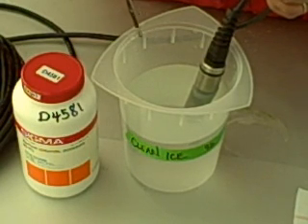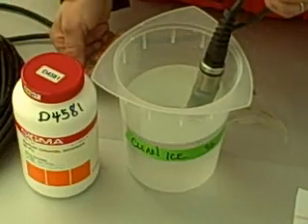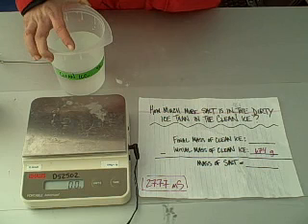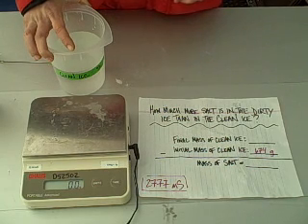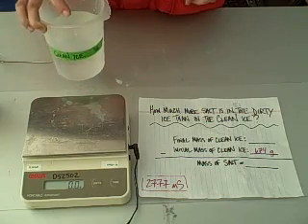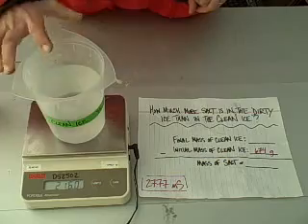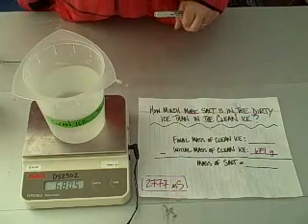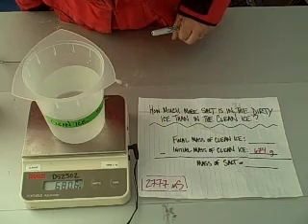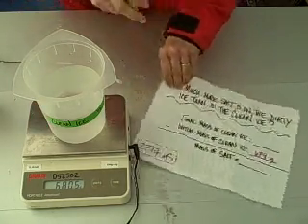Yep, we're about 2,800, and so with this precise measurement, it's probably going to be pretty good. So the last step, now that we have added the salt to our beaker so that it equals the same conductivity as our dirty ice, is to measure the mass now of our clean ice with the added salt. So you place it on the balance, and we get 680.6. So you write that down.